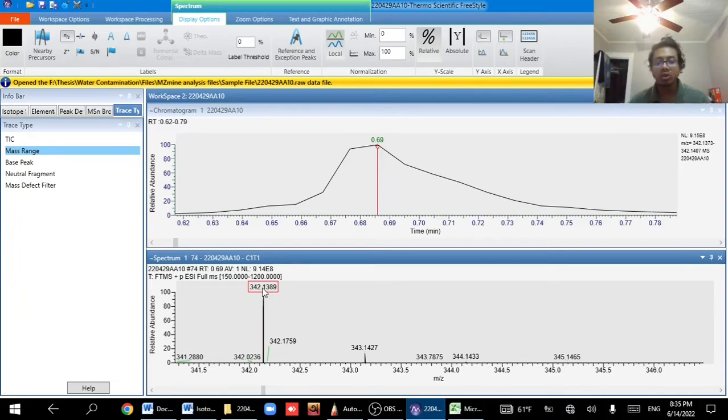It is not exact and could be up or down, like 20 or 21, or even 10, but it could not be as low as 1, 2, or 3. So you have an assumption of the carbon count, and you got about 13 carbons there. Now make it 0 again, and then you get the difference 2.004.